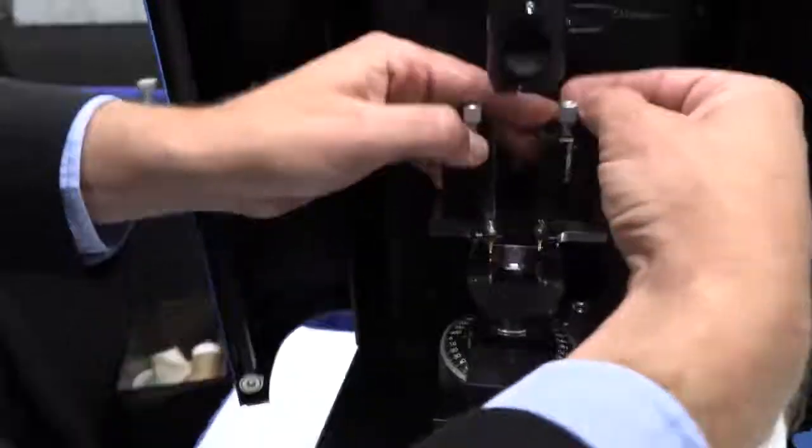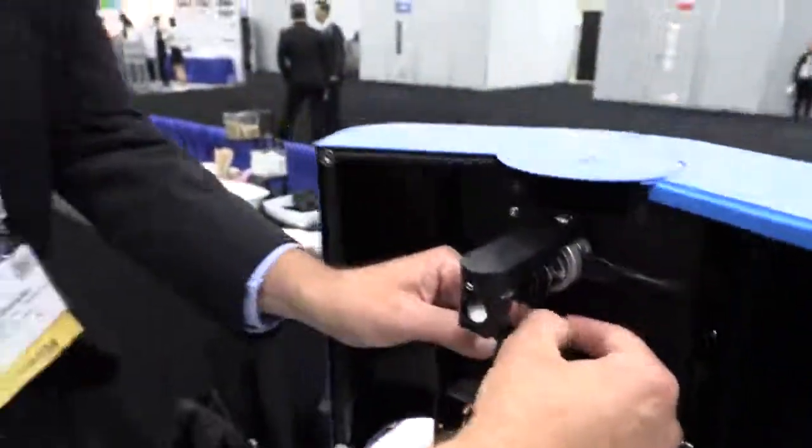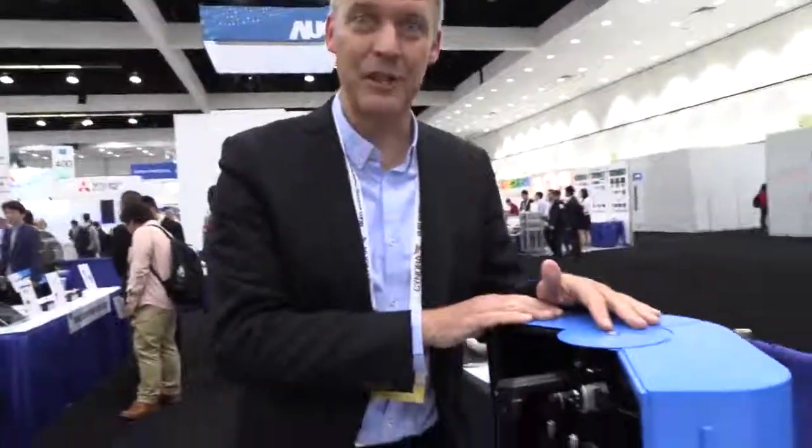So who would be using this? We have customers in the OLED industry, the big players from Korea, Japan, China, and everywhere in the world. So how do they put their samples in there? They have to make them in their own labs. They are making such research samples in order to play around with new chemicals that the suppliers of the material give them, and they need to select the right materials for highest performance OLEDs that are stable and highly efficient. So we're giving enabling tools to the industry.